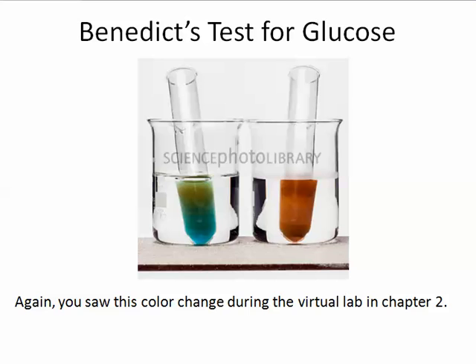We've had varying results. The lab requires that you pay attention to detail. When it asks you to wash off the Ziploc bag, it's important that you do that. When it asks you to blot it dry, you need to follow that instruction. Weigh it before you put it into the beaker of water. Weigh it again afterwards. We also want to talk about the water. Does the water move through the membrane in and out of the Ziploc bag?